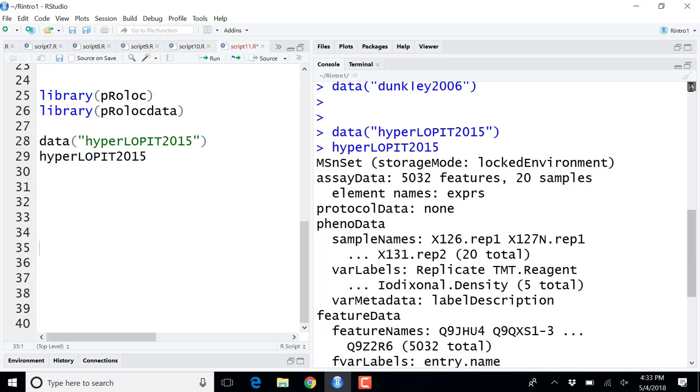But in addition to that, the MSnSet supports additional feature metadata. So each protein here has another row in this associated data frame with annotation: what GO term they belong to, what description, any other type of annotation, p-values for example, associated with this protein, intensities for this sample. We have as much annotation as we need.